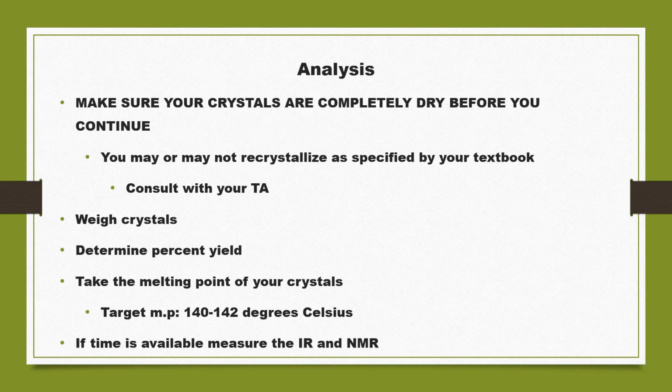However, before you make any analysis, make sure that your samples are very dry. Normally we leave the sample overnight, but I don't think you should do that in here. Rather, if you effectively wash the sample and place it in a very dry place, you may also need to change the filter paper or add another filter paper at the bottom of it, so that it will aid the drying.